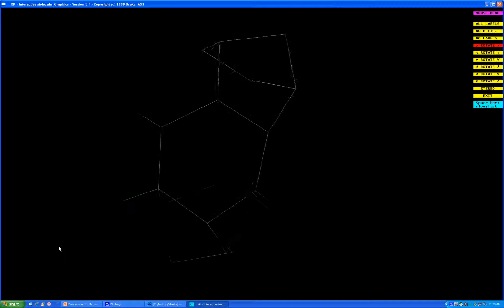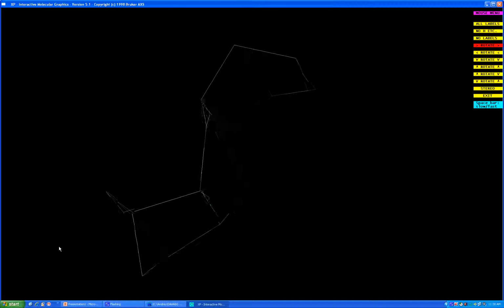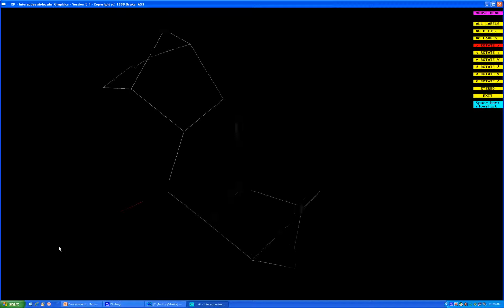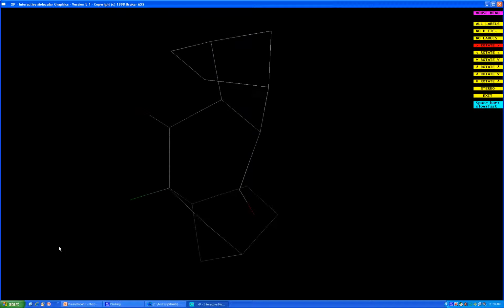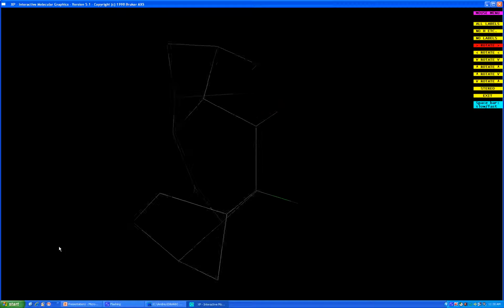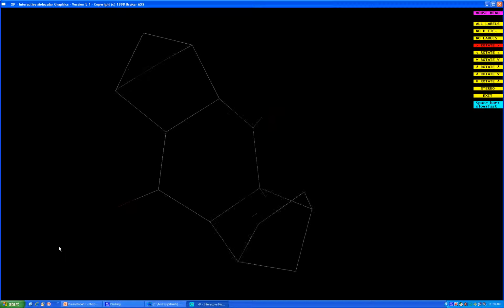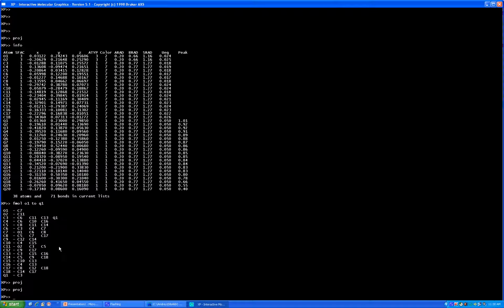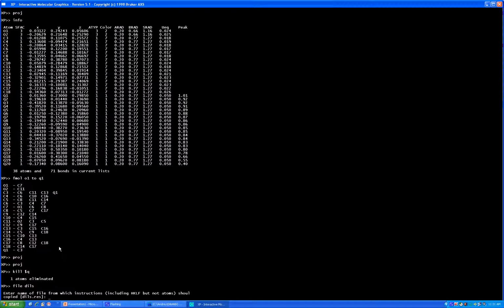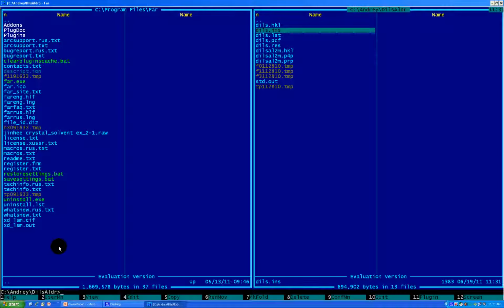But hopefully now you can see it clearly corresponds to one of the hydrogens. So it doesn't correspond to any other additional atoms. But we cannot name any hydrogen atoms until we go to anisotropic refinement, and that will be our next step. So let's go out from here. What I want to do is kill qpix. Do not save the qpix before a new cycle of refinement. Save only atoms. And again I'm typing the file name Diels. Say quit.